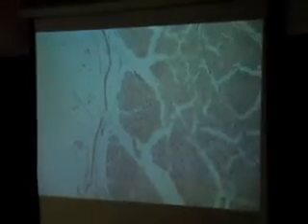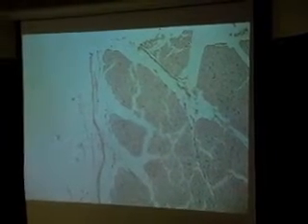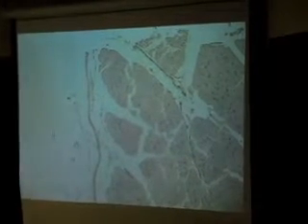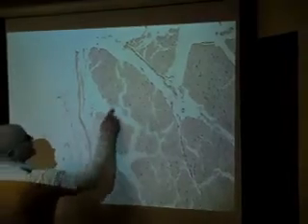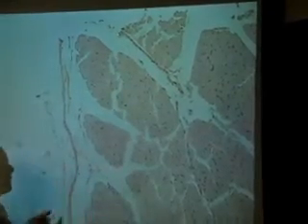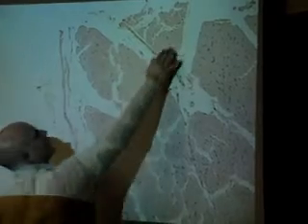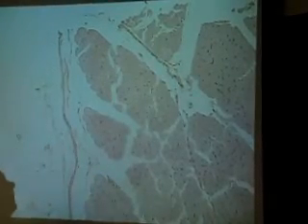of the skeletal muscle. I'm going to move back out to medium power. So when we look at this stuff in medium power, what you can see is we can see groups of muscle cells. So this is a group of muscle cells, this is a group of muscle cells, we're seeing another one here, and this one over here. And each one of those is called a fasciculus. So plural is fasciculi, so you can see a group separated out there as well.